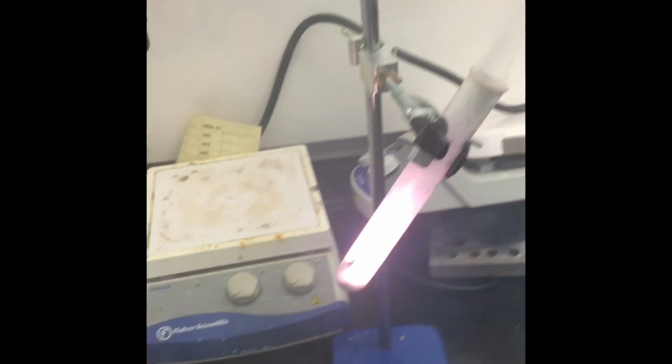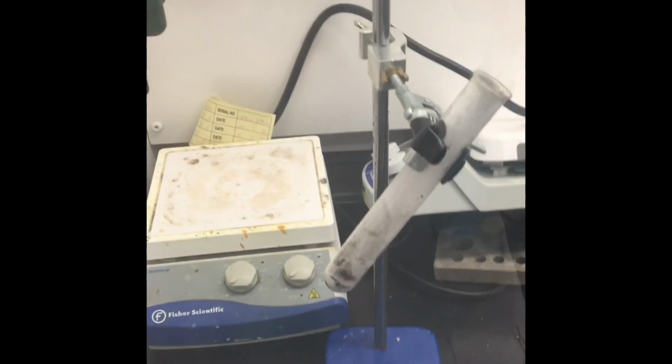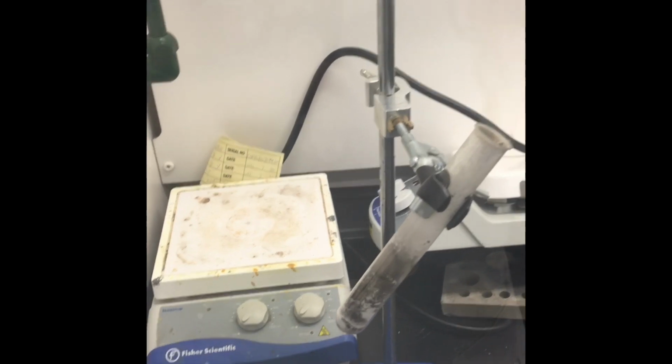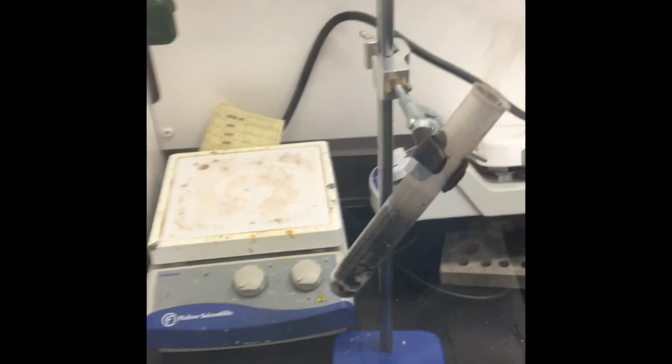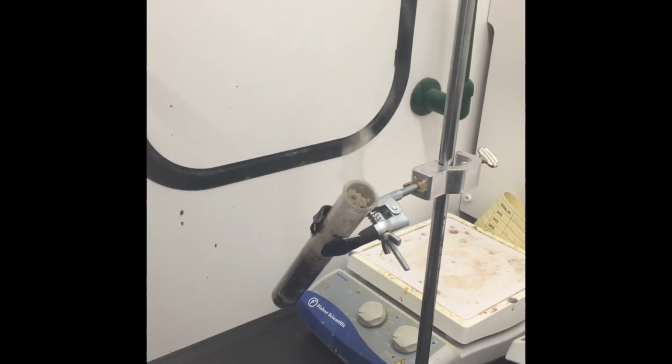Okay, so you see the flame inside? That flame inside is purple. That purple color comes from the potassium. When we burn potassium with a flame, you see a flame that is purple. Oh, look at that. Poor gummy bear. Now, what actually happened here?